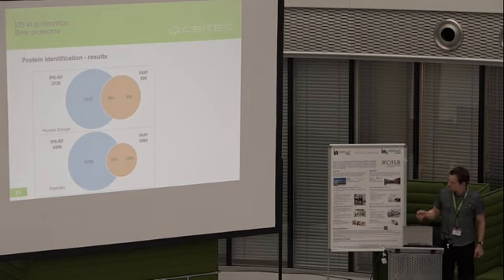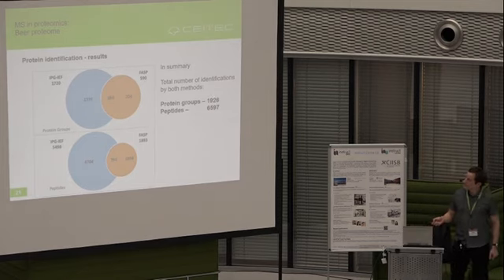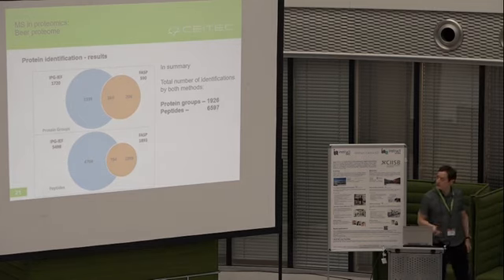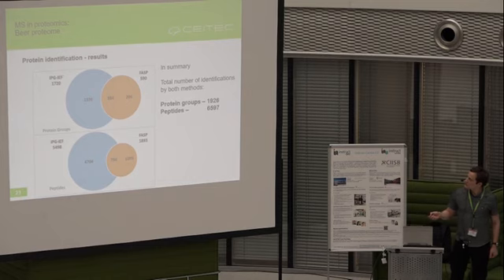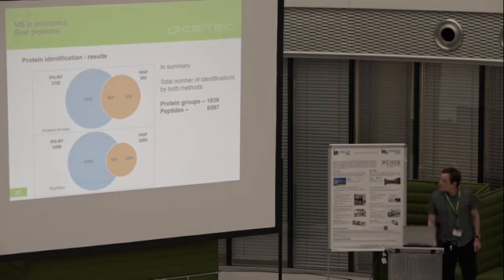Here is the result. So overall, we were able to identify almost 2,000 proteins in beer. And you can see how important it is to develop method variants and to improve the separation efficiency, because using the routine protocol, we saw only about 600 proteins, but as analytical chemists, we wanted to see more, and by employing the fractionation, which was a method optimized in our lab, we can reach the final result.